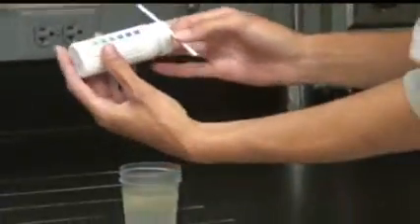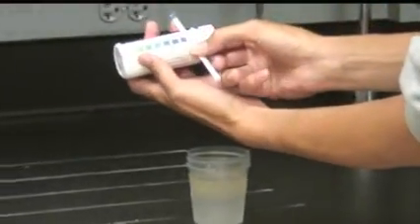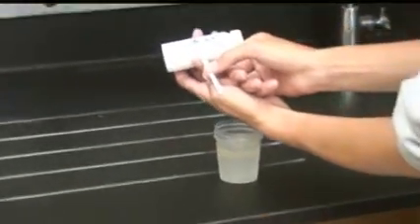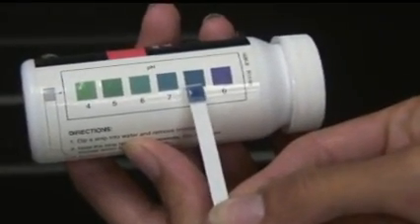Then, compare the color that is developed on the top of the strip with the chart on the side of the pH bottle, moving your strip back and forth until you find the color that most closely matches that of the strip.